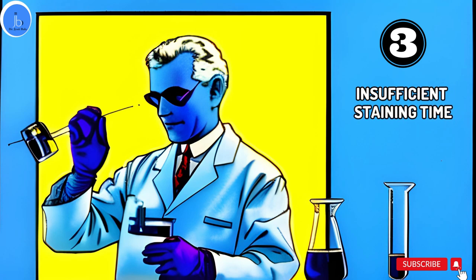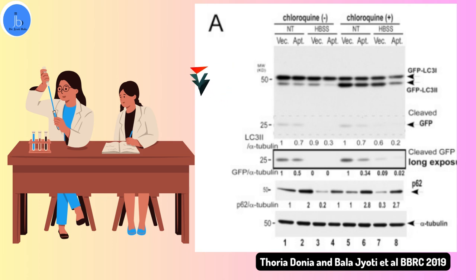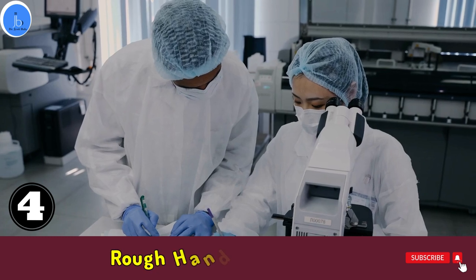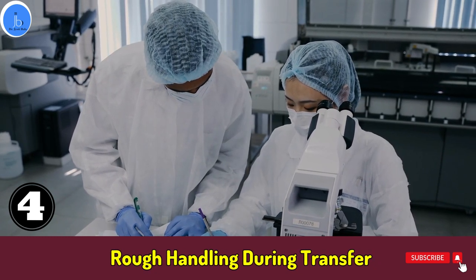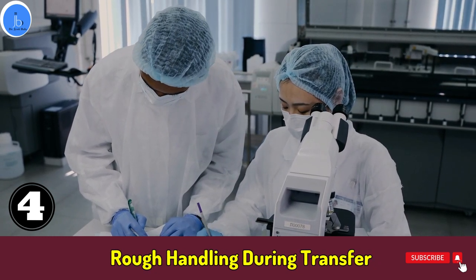Mistake number three is insufficient staining time. Giving the gel insufficient staining time can result in faint or unclear protein bands. Follow the recommended staining time to ensure proper visualization of your protein sample.